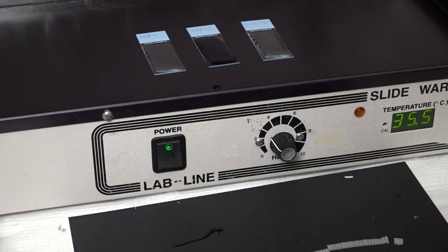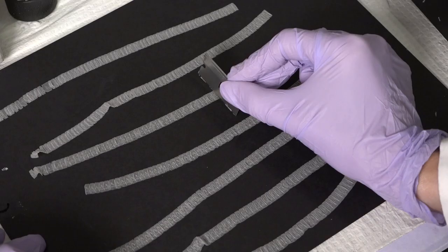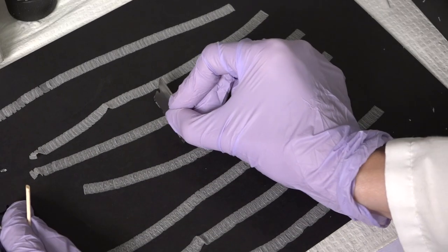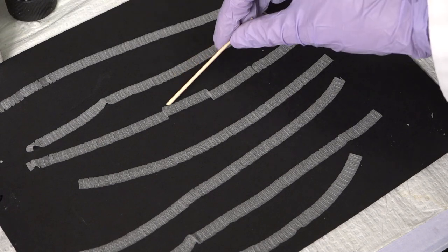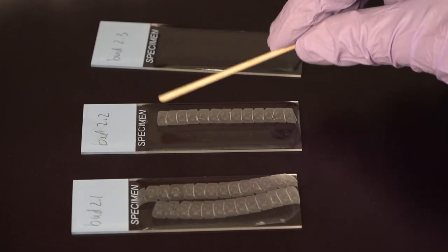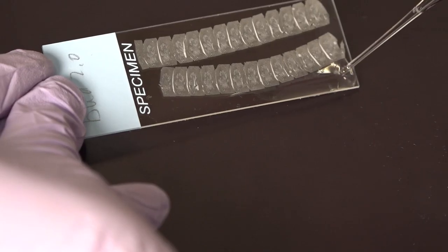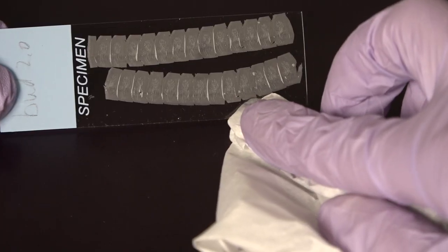I've laid out my empty slides on a slide warmer and pooled water on top, which will get warm too. I've chopped up my ribbons into slide-sized pieces, and then using a dowel, I can pick up the ribbons and float them on top of the water. The heat will relax the wax and smooth out all the wrinkles. Next, I'll wick the water away so the sections will lay flat and stick to the glass.